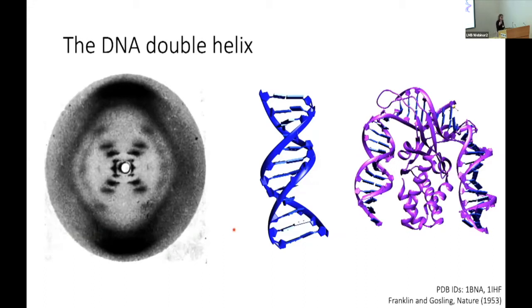DNA. And it's a really lovely paper that shows that DNA can make a full U-turn around an IHF protein. But actually, this was only obtained by annealing a load of oligos together and leaving some big gaps in order to allow this to crystallize. And I think we know that every experiment we do has flaws.